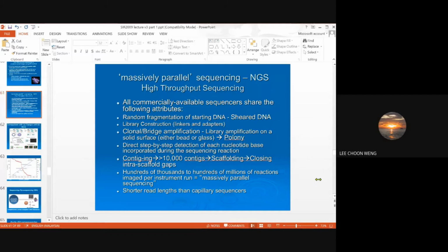Okay, so for specific occasions, as I've also mentioned earlier, if you're doing qualitative comparison of sites where you target a specific genus or specific family, you can still use DGGE or TGGE. You can also use cloning. My student in the past has used cloning to look at the diversity of archaea in our waters.